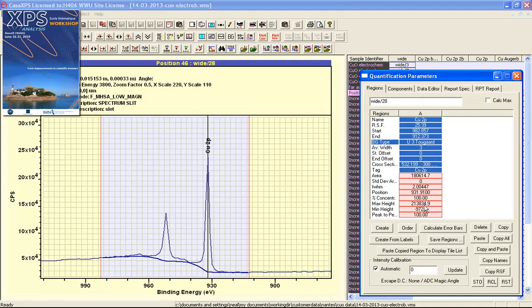We have the maximum height and the minimum height with respect to this interval. That's if the relative sensitivity factors are with respect to height rather than area. But the Schofield cross sections are based on the peak area in counts per second eV, so we would not expect the peak-to-peak concentration based on this RSF and other RSFs for different peaks to make any sense in terms of a height.